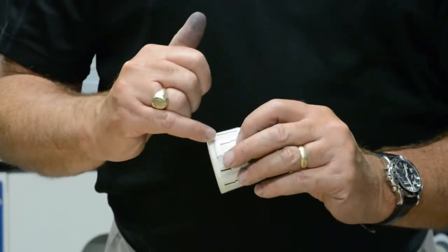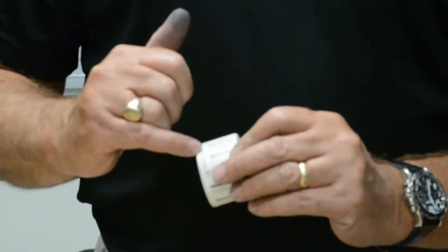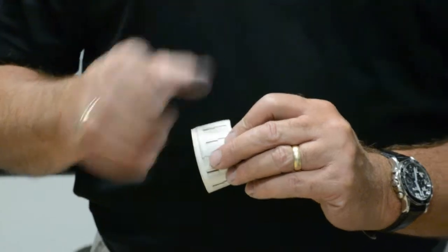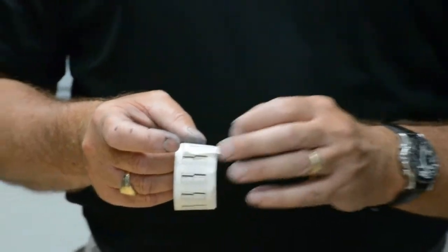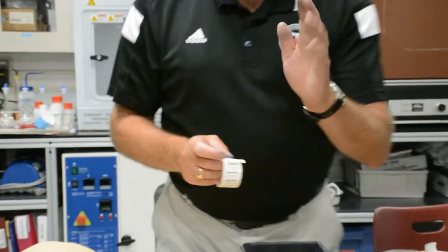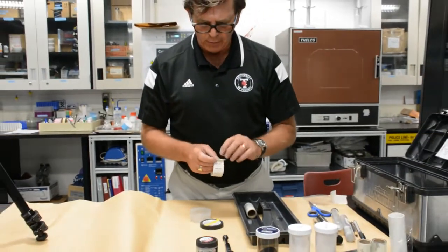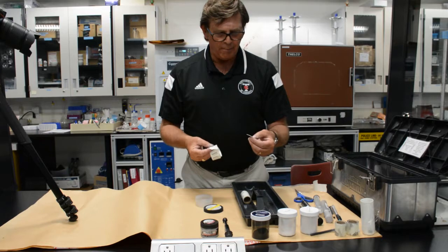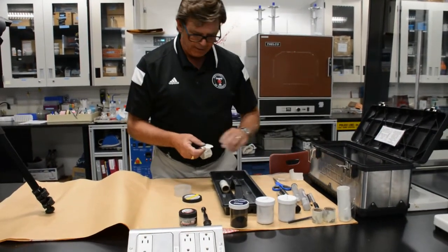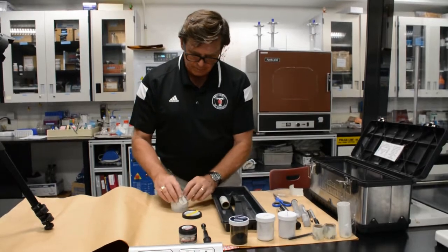Some of these have a very limited area for development purposes, or for writing purposes. Some of the other scales are a little bit larger and afford more opportunity to write information on there. But again, we'll explain that as we go through. So these are simply just a peel and stick application, and we'll explain their use as we go through.